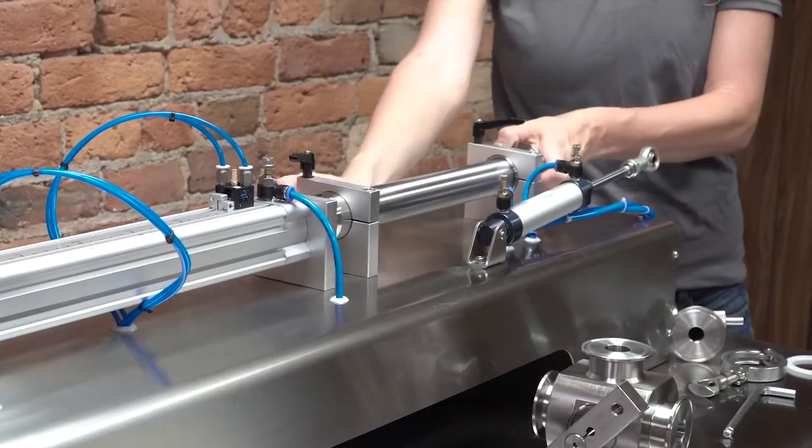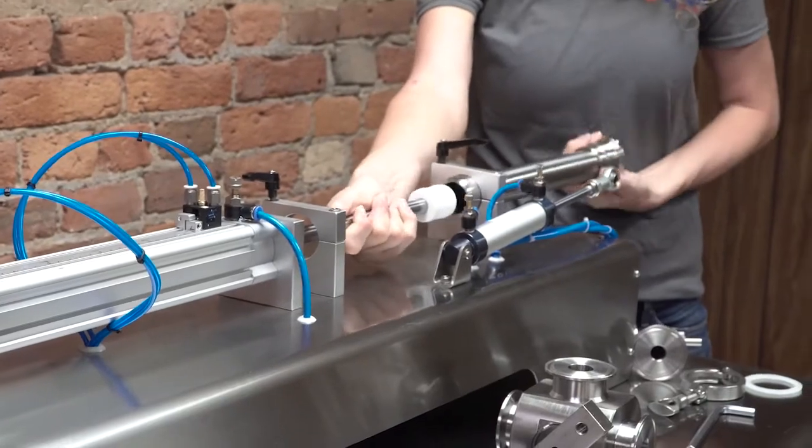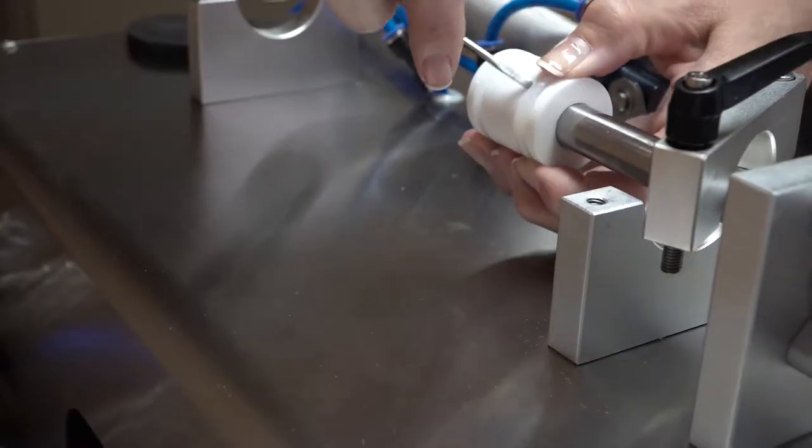Loosen both of the two ratchet style handles and remove the product barrel. Remove the piston o-rings.